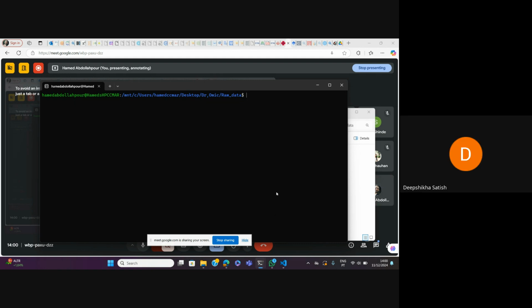Just type here sudo space aptitude. I didn't get it. I will just send this command in the chat.